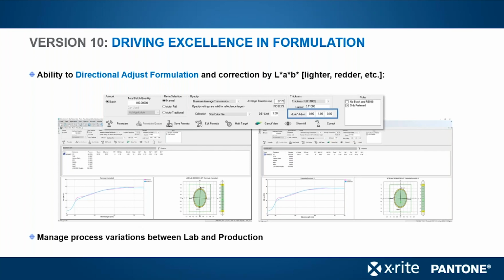So if you can quantify that type of behavior, or if you have known shifts between lab and production because of additives and things you're adding, we can take that information into account in our formulation process. So we can directionally adjust the formula, by L, A, or B, at the point when you're formulating to compensate for these other shifts in color that may occur later in the production process. So this is available in version 10.